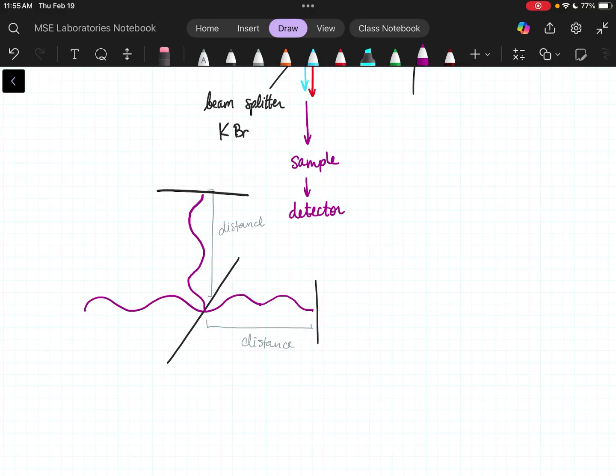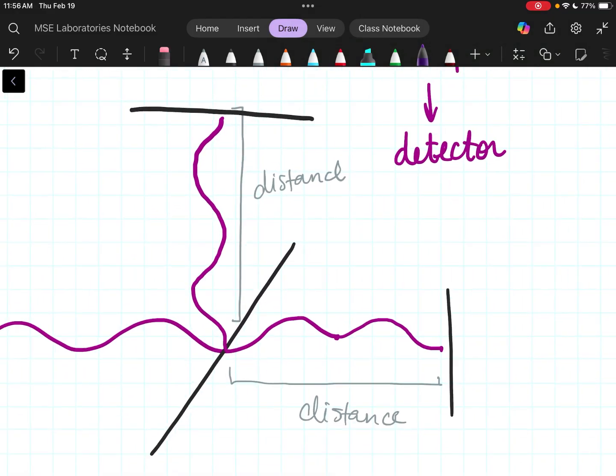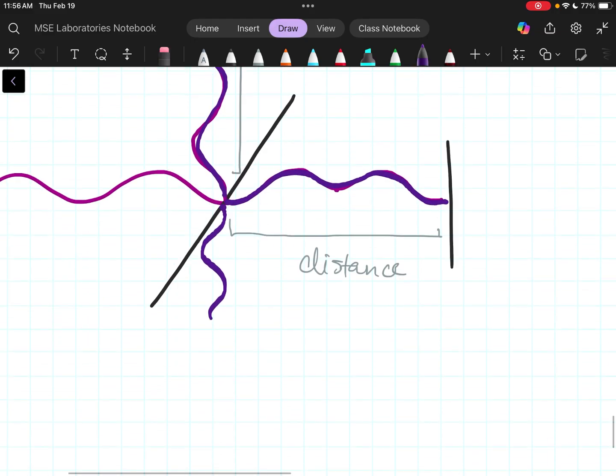If we place that secondary mirror at the same distance from one another, then the bounce back, again, we're going to start at the low, and the bounce back is actually going to follow exactly back on itself. I'm going to change my purple color ever so slightly so it's a little more obvious. So when it hits this mirror, it's in a low position, and it's going to travel exactly back on the same path that it traveled.